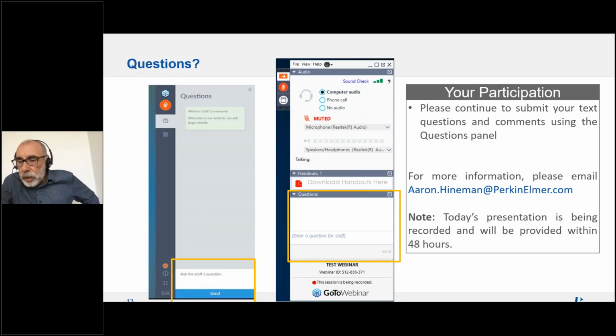For instance, you can get information from single particle ICPMS, mostly related to the particles, but also to the dissolved fraction of one element. If you couple with FFF, you can get detailed information about this dissolved fraction.